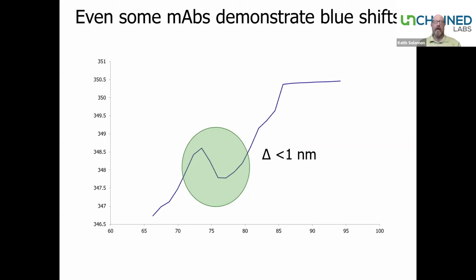And I'm going to suggest that sometimes all of those solvent-exposed aromatics, if the FAB is melting by itself, may contribute a great deal to the fluorescence emissions, and those solvent-exposed aromatics falling into a more hydrophobic space may result in a blue shift of antibodies if there's an early transition, FAB alone melting. So you might find that in some of your antibodies on occasion.